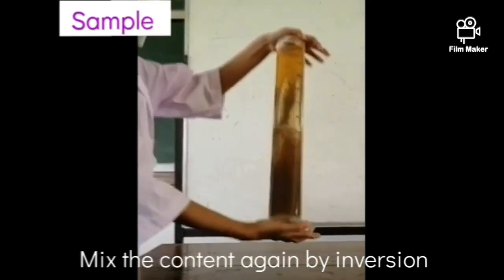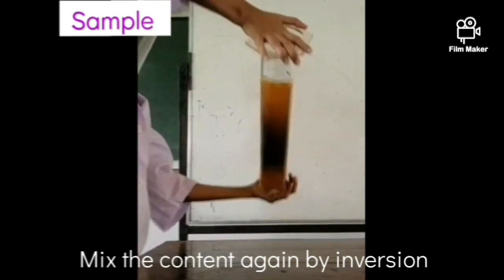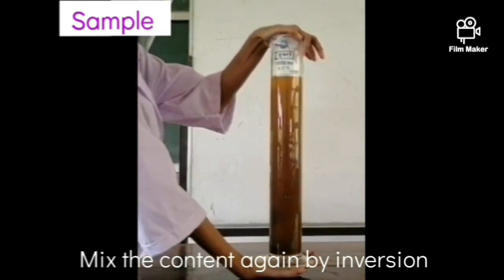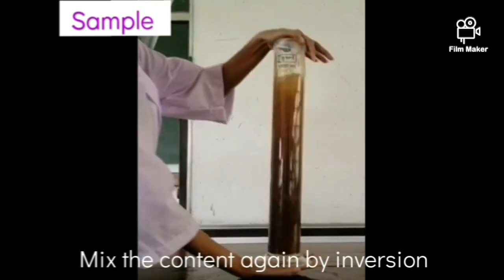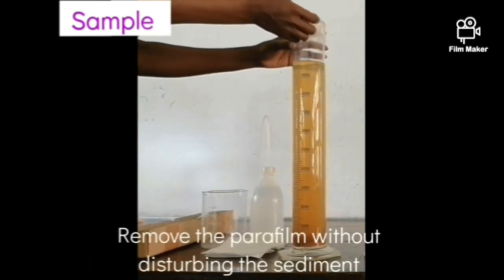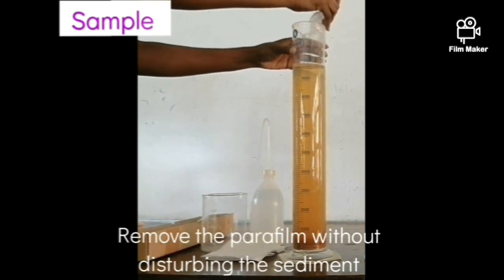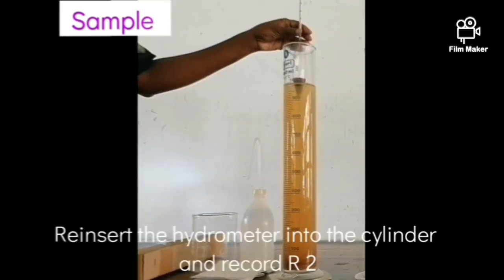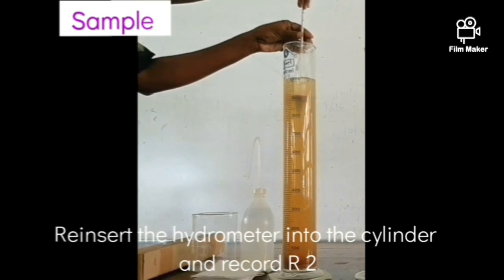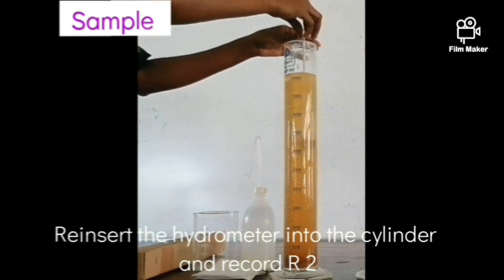Cover the opening of the cylinder using a parafilm and mix the solution by inverting it. The next reading should be taken after 6 hours and 30 minutes from initiation of settling. Remove the parafilm carefully without disturbing the sediment. Re-insert the hydrometer carefully 10 seconds before the reading time to let it establish in the solution, and take the reading as R2.